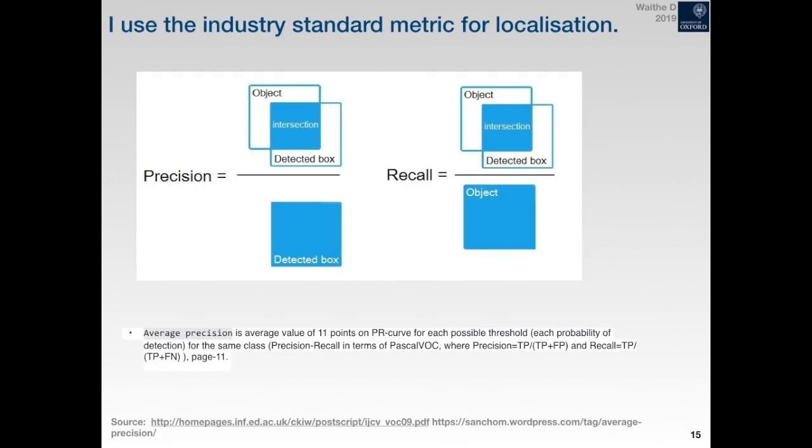But just showing you examples isn't great because I could have cherry-picked those images. But what we did is we employed this sort of industry standard metric for assessing the localization, something called the mean average precision, which makes sure that your predicted bounding boxes are evaluated in a fair, sensible way. So they have to overlap the ground truth bounding boxes where you've labeled it in your training material, but they also have to not overlap everything.